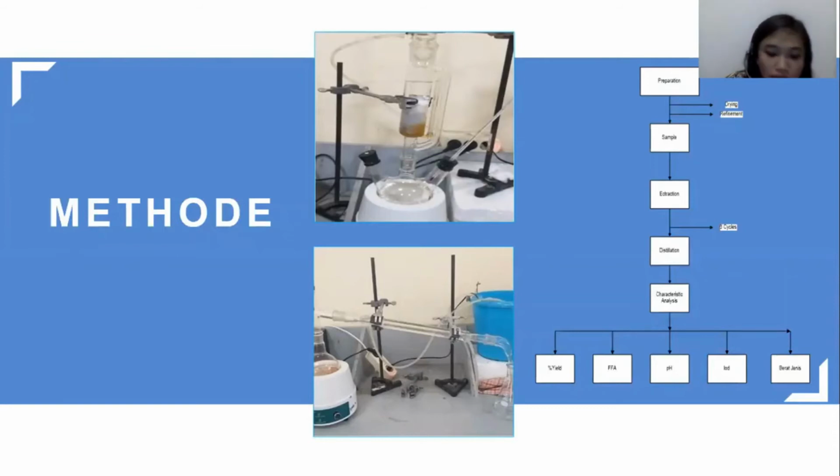After the extraction process is complete, the sample is then distilled to separate the solvent from the oil product from the plant fruit. As with the extraction process, the temperature during the distillation process is 65 up to 70 Celsius.